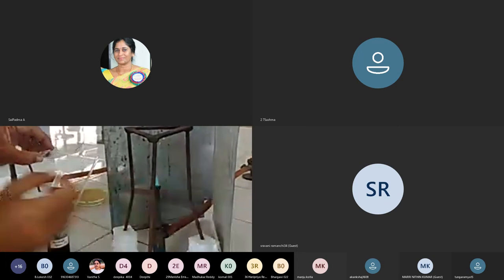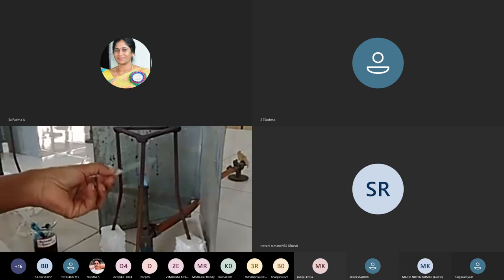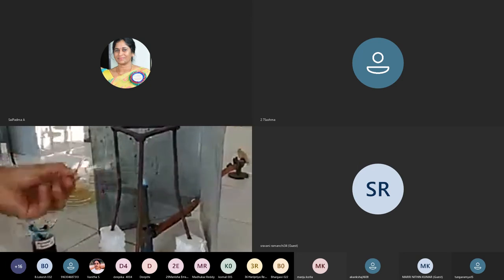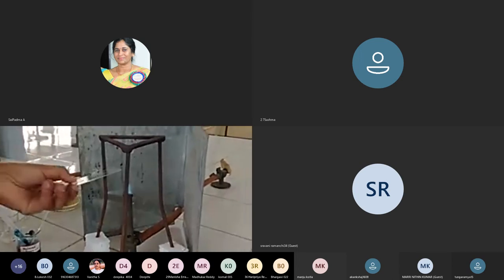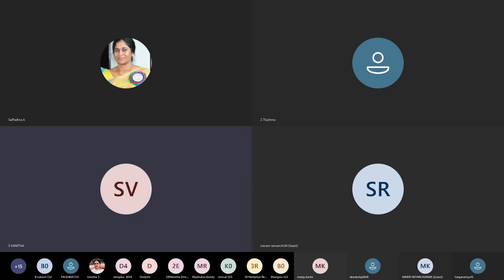So now what we will do is the process of heat fixing, so just show it under flame once or twice, so that it gets heat fixed. So similarly, the previous slide also, we have already air dried it, so it must be fixed, but one more time on the flame slightly we will show it. So this is heat fixing of the smear. Step number one we have done. So now we have prepared the smears. Next step is going to be the staining process.